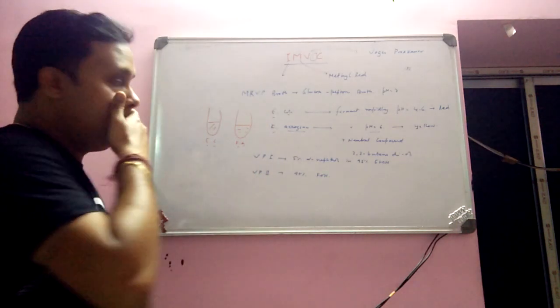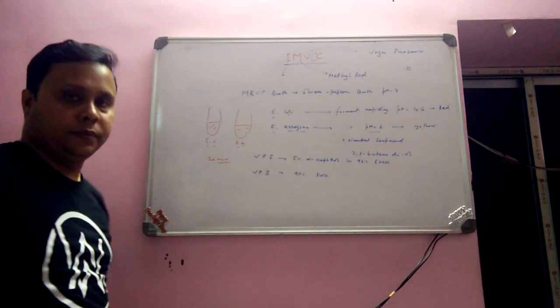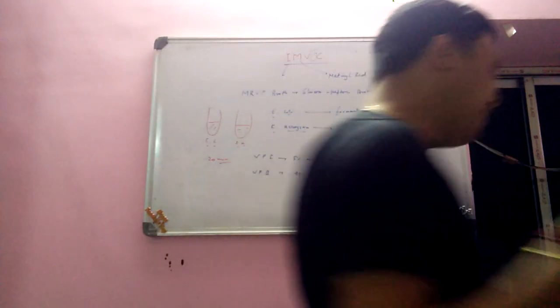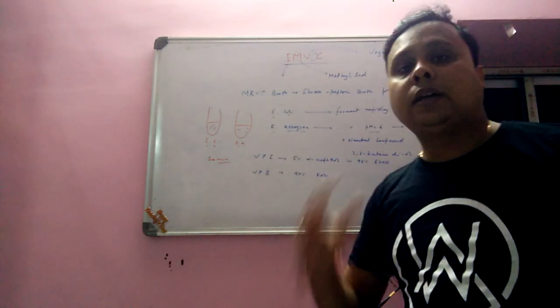After exposing for at least 20 minutes, what will happen? The tube that contains Klebsiella aerogenes will be pink color, a pinkish red appearance, but not for E. coli. The E. coli tube remains unchanged.